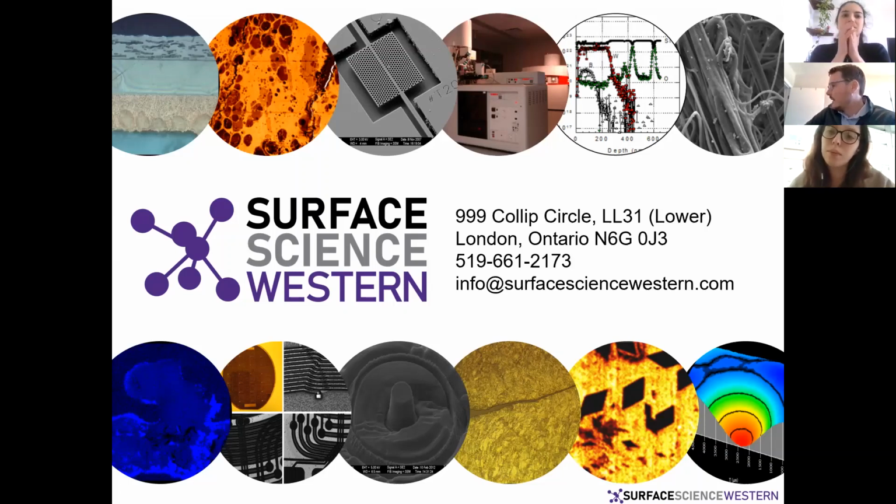I've done a bit of work in europium, and I've seen some stuff, but other than a few reported spectra, and for some of them, really oddballs, they don't even have reported spectra. They have complex peak spectra, and if you're looking at a system, you're going to have to run some reference spectra to start with. Look at some of the oxides, but it's difficult to even get standards for some of these.